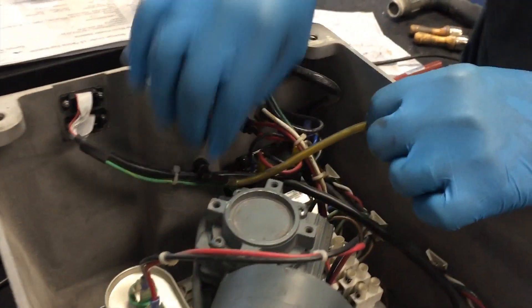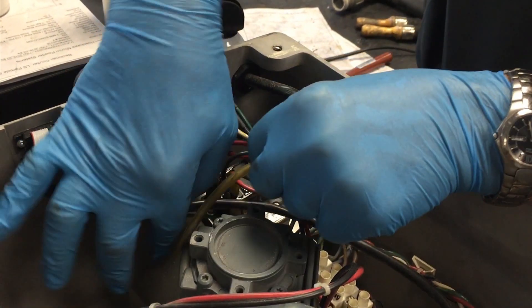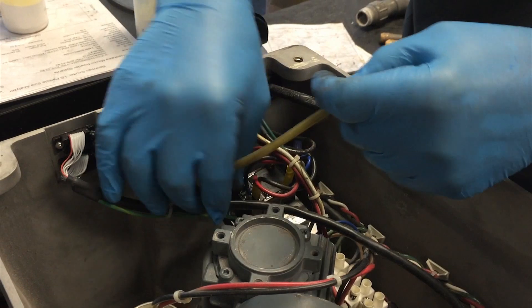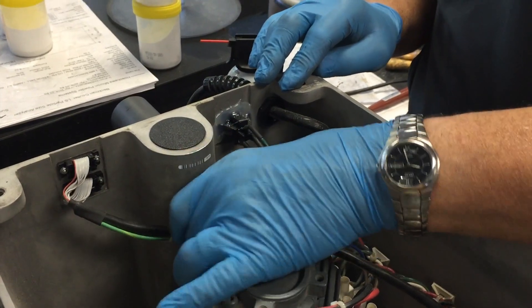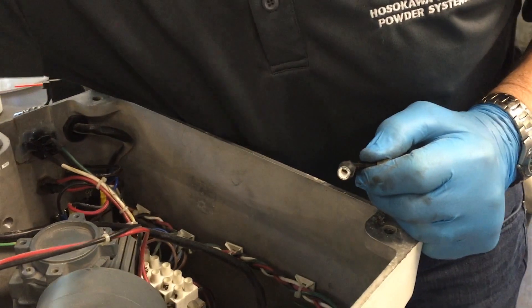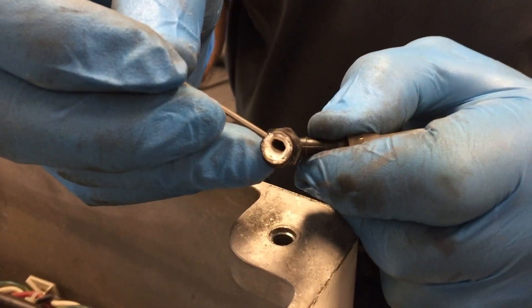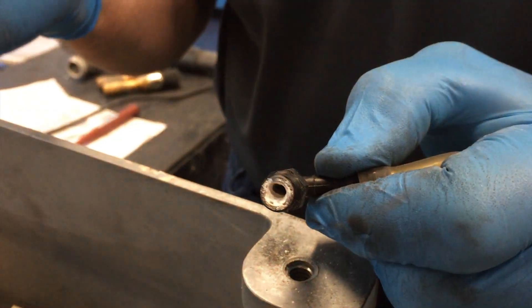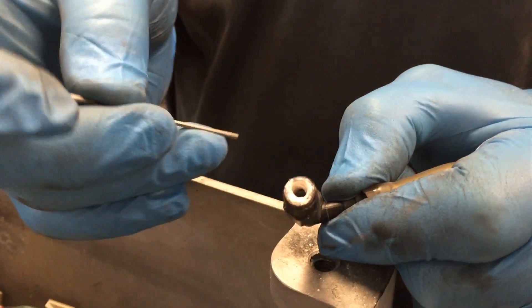Prior to entering into the filter, the air pressure is passed through this hose. As it's passed through the hose, it has to go through this elbow. Within the elbow, there's always the potential of accumulated material. That material must be removed; otherwise, your vacuum pressure will be upset and have blockage and not give you the proper indication.